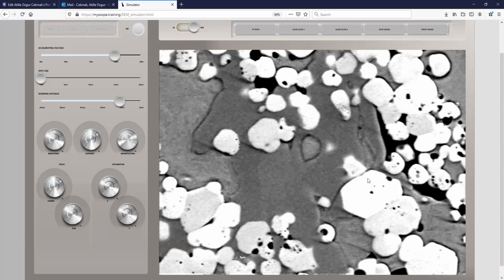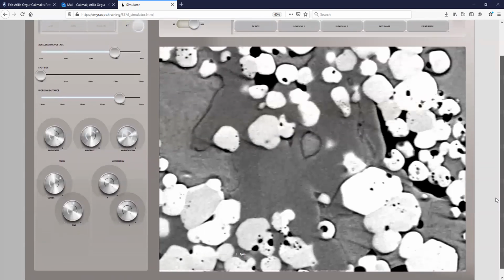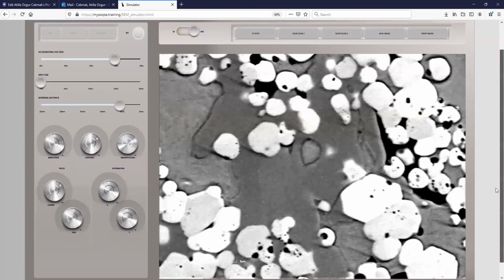The dark spots are not giving us enough intensity of the backscattered electrons, whereas there are lots of bright spots here. The bright spots are telling us that those are either dense configurations of the atoms, or there are higher atomic number particles located in those areas. So we get a better understanding about the nano characterization and nano seeing the samples.